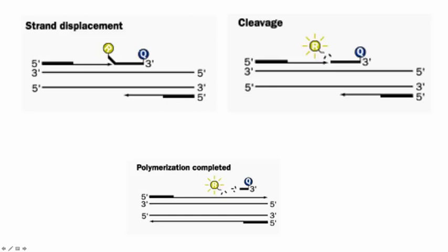But in TaqMan, you have this extra little third probe with a reporter and quencher that will undergo fluorescence resonance energy transfer, or FRET. So when the reporter is within a certain distance of the quencher, the reporter is hit by a particular wavelength of light, transfers that energy to the quencher, and no answering wavelength of light is then put out.